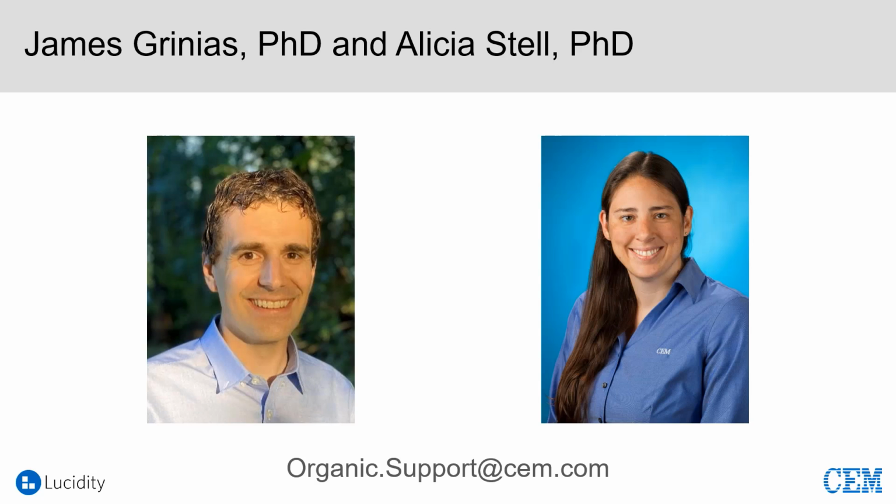Very good, thank you. Let's see, the next question is, what considerations should be made for column selection using this system? So I think in terms of overall column selection, as I mentioned, there are a lot of different columns out there. We really talked about just C18 reverse-phase columns. Those are probably the most common columns used in industry, but there are a lot of other options out there as well. The way the system is set up, you really do have the flexibility to install columns from pretty much any vendor, as long as it has the standard 1/16th inch end fitting, which I'd say is probably 95+% of the column end fittings that are out there.